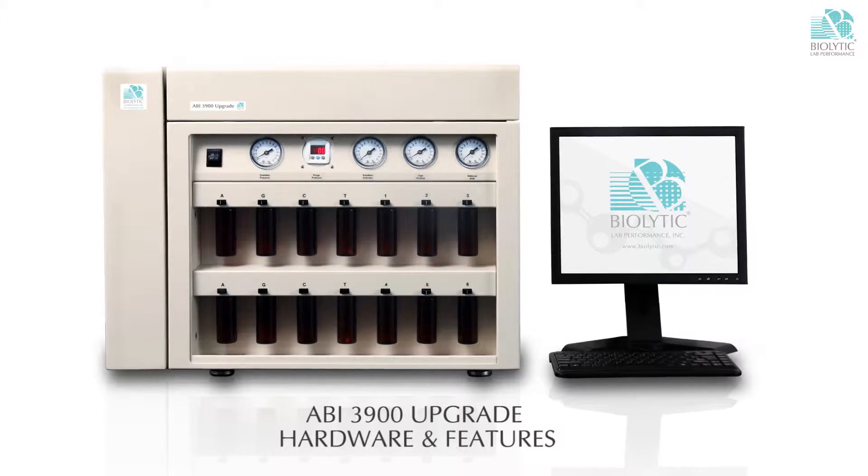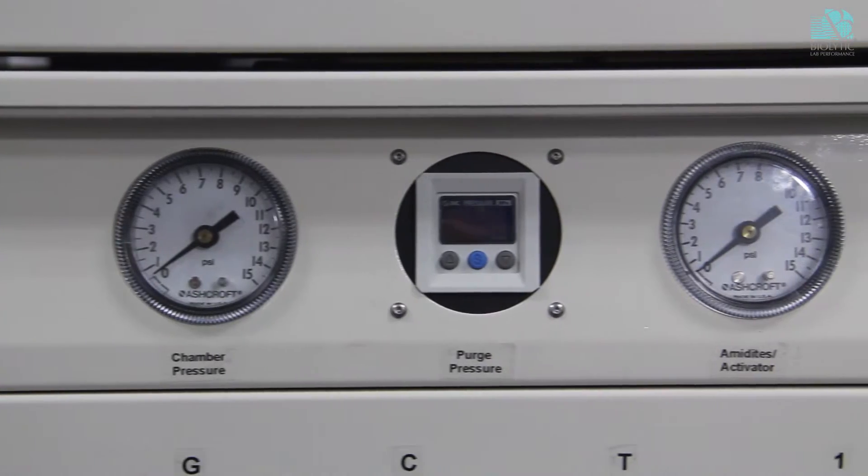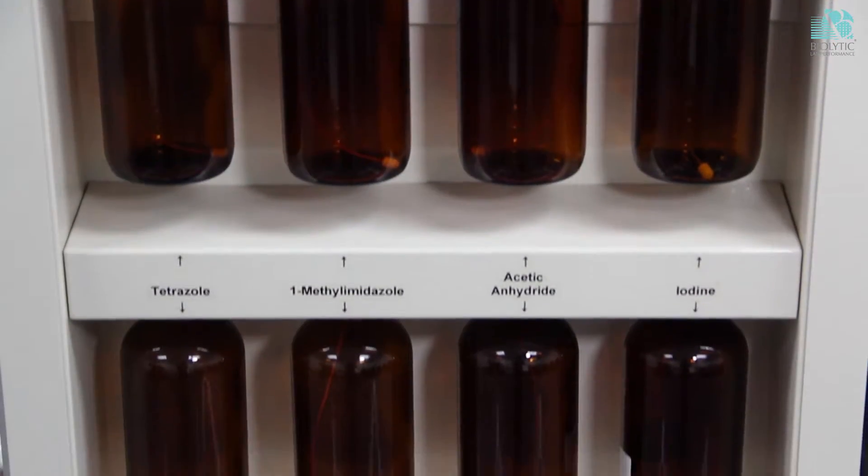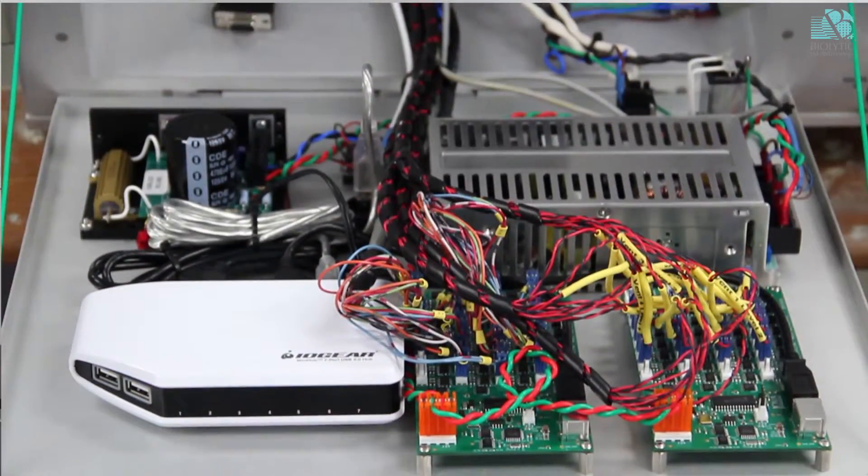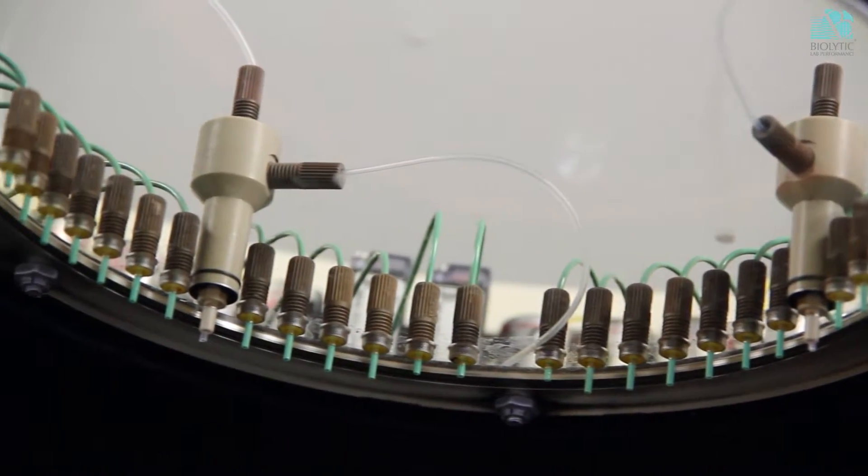Today we're going to look at the Biolytic 3900 oligosynthesizer. We have upgraded it with an upgrade kit that's designed by and installed by Biolytic. The upgrade kit can be applied to any instrument that's of similar design.